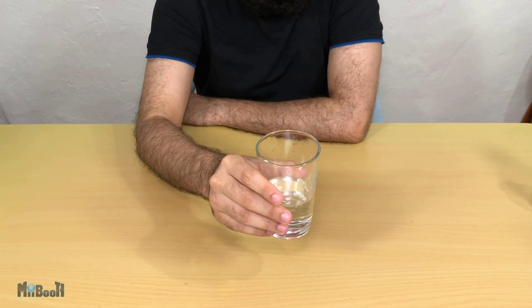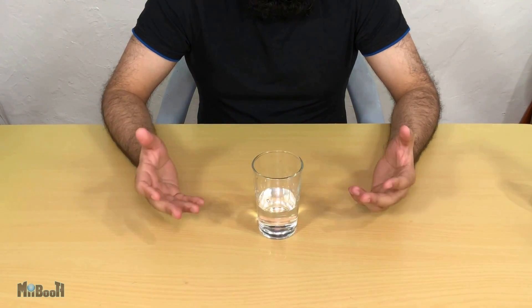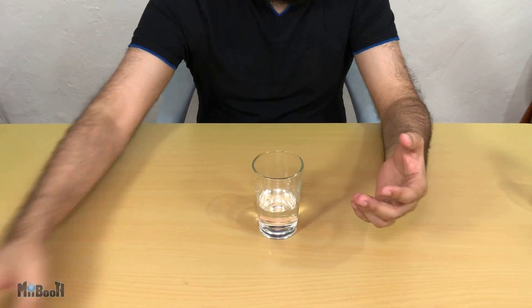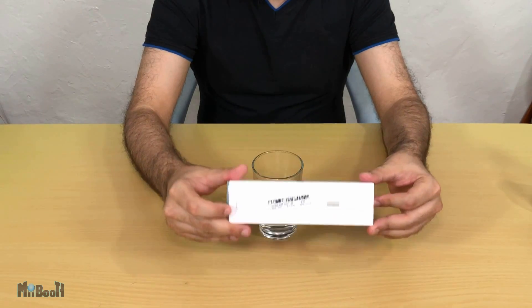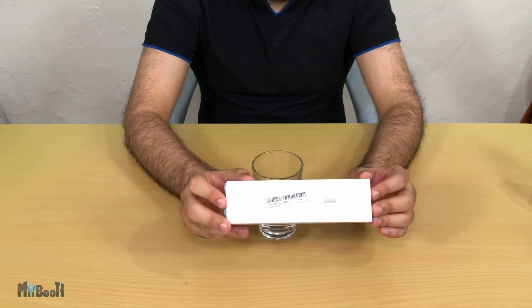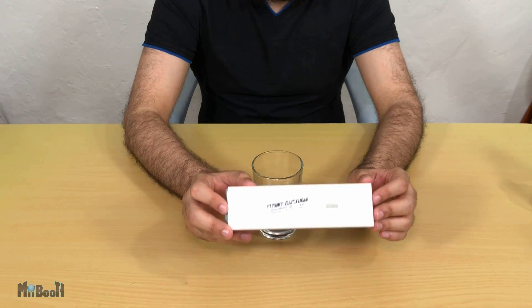How do you tell if the water you're drinking is safe? No matter where your water comes from or which brand it belongs to, it always has a certain amount of dissolved solids in it. Today I'm going to check out this neat little device by Xiaomi — a water TDS tester from banggood.com that retails for only $6. In my opinion, this is a must-have if you're going camping or drinking water from a source you're not sure about.